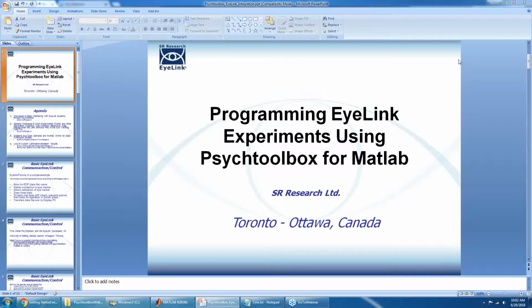Okay, everybody, welcome to the webinar on programming EyeLink experiments using Psychtoolbox for Matlab. In this webinar, we're going to talk about a few different experiments that have been programmed in Psychtoolbox for Matlab that interface with the host PC and EyeLink eye tracker and allow you to do different things. We're going to get into a little bit of detail about some different aspects of this stuff.